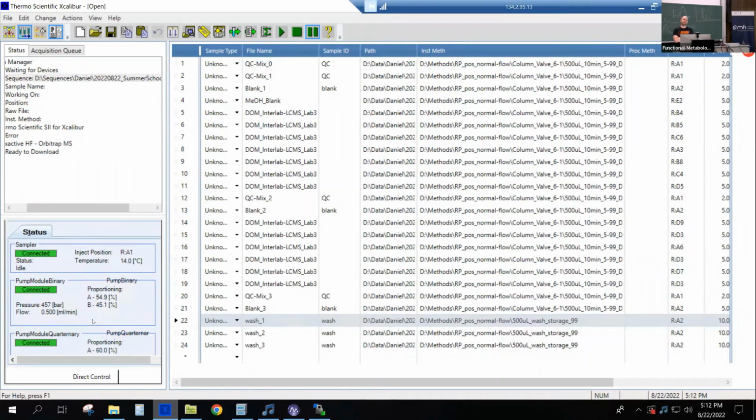The apex trigger, the time you set, you just look at peaks first, what time you have. Yeah. Second question was, I see you use different injection volumes for the QC. Yeah.